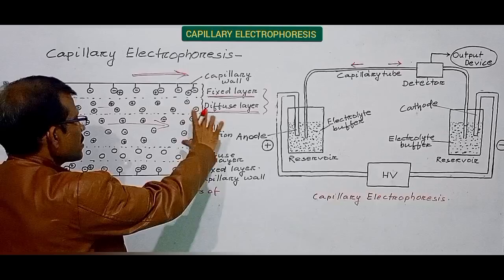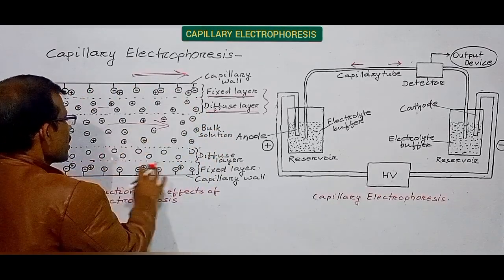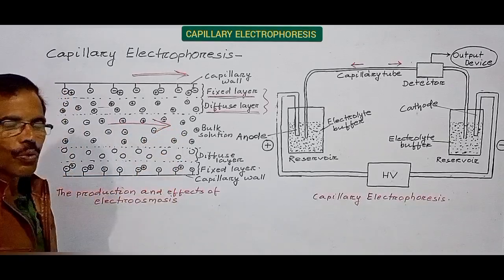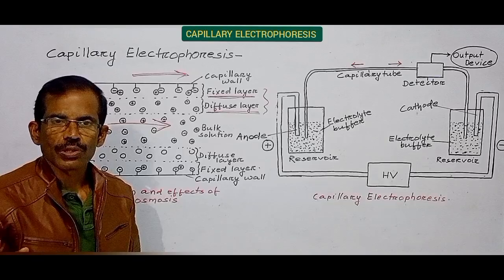This movement of the bulk solution through a charged surface towards the cathode under the influence of an electric field is called electroosmosis.